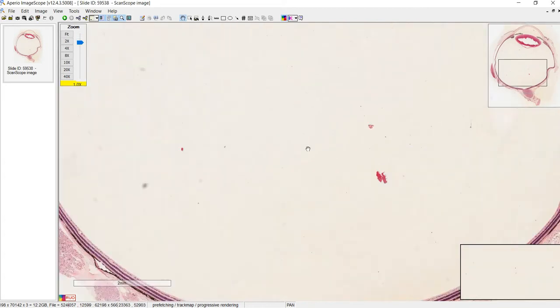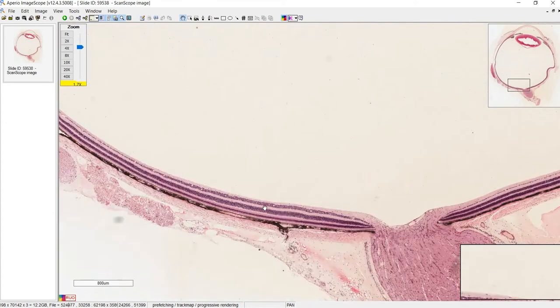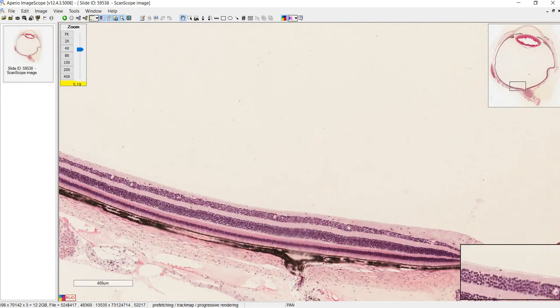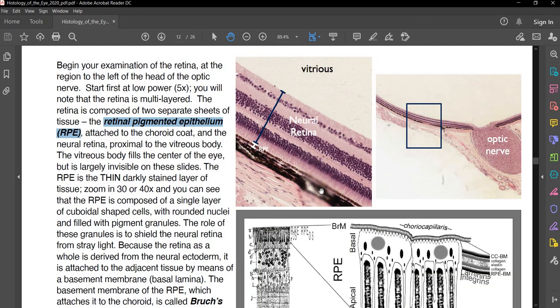The fovea, if it were in this slide, should be somewhere directly past the lens, but I don't think it's actually included here. It should look like a little pit where there are very few ganglion cells. The reason is that at the fovea — where you have your sharpest focus — you don't want ganglion cells getting in the way of light. There you can also have a very high concentration of cones relative to rods. The outermost layer of the retina we need to identify is the retinal pigmented epithelium (RPE).